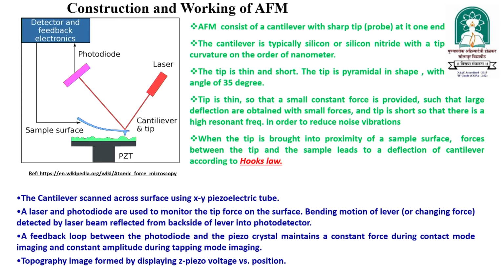In the working, the cantilever scans across the surface by using the XY piezoelectric tube, and there is a laser and a photodiode system that are used to monitor the tip force on the sample. The bending motion of the lever, or changing force, is detected by the laser beam reflected from the back side of the lever into the photodetector.